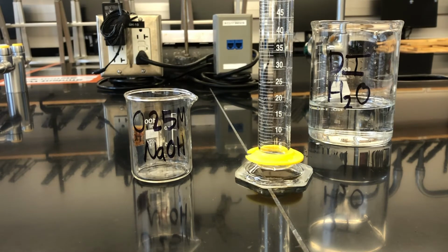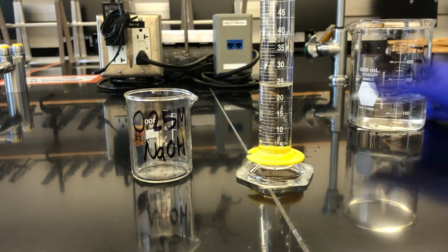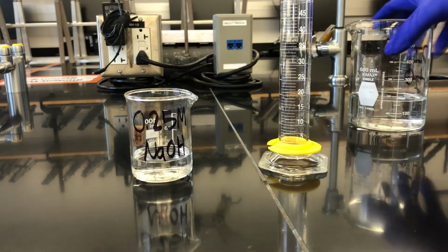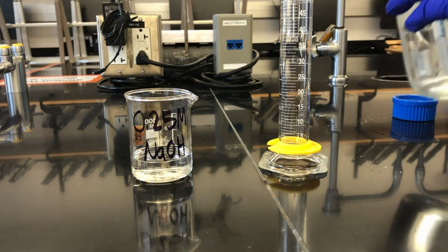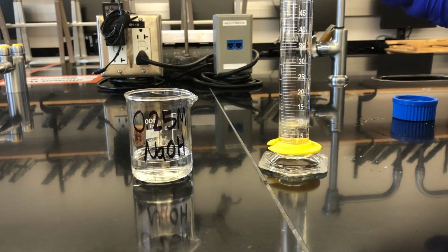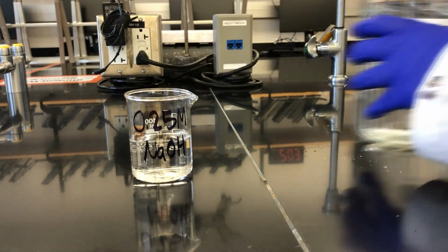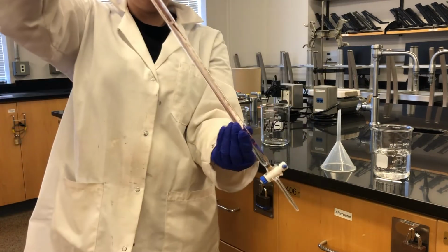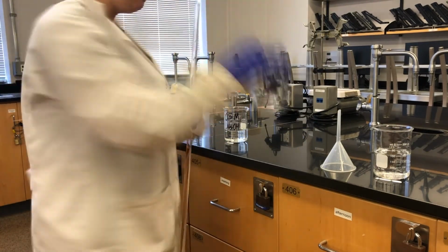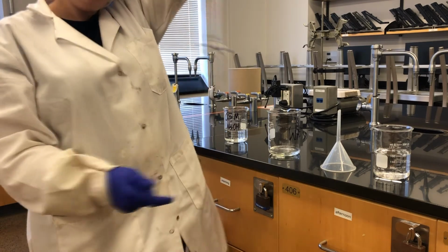Next, we prepare 50 milliliters of 0.25 molar sodium hydroxide solution by measuring 25 milliliters of deionized water into a clean beaker, followed by 25 milliliters of 0.5 molar sodium hydroxide stock solution. Next, we prepare the burette for the titration by discarding the excess titrant from Part B and reconditioning the burette twice with water and then twice with the freshly prepared 0.25 molar sodium hydroxide solution.